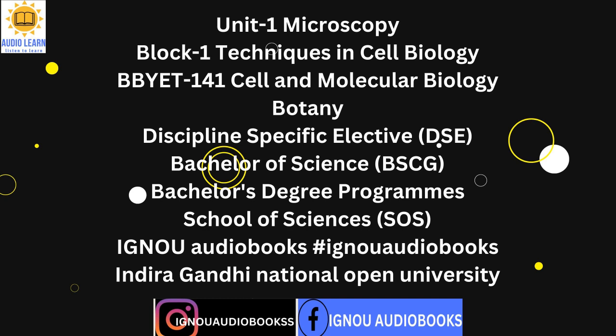1.3 Electron microscopy, EM. Electron microscopy is a technique that helps in getting high-resolution images of specimens, biological and non-biological. A beam of electrons is used as the source of illumination. The electrostatic and electromagnetic lenses are used to control the beam of electrons and focus it to form an image. Basic components of an electron microscope.